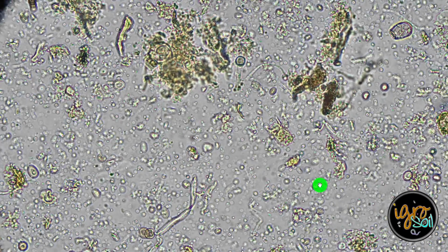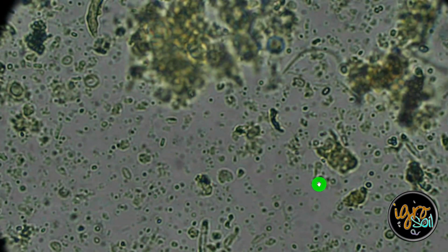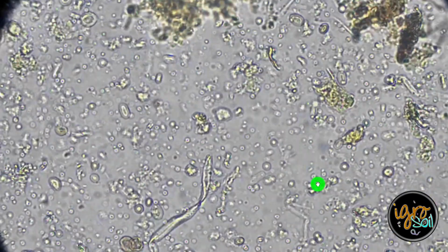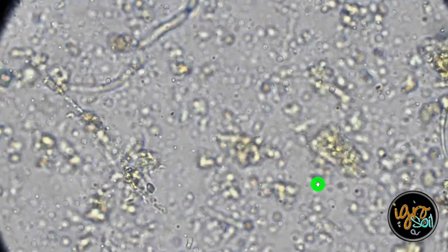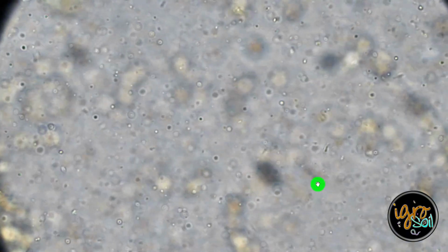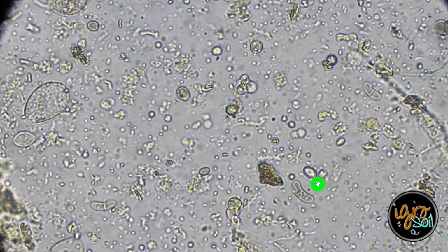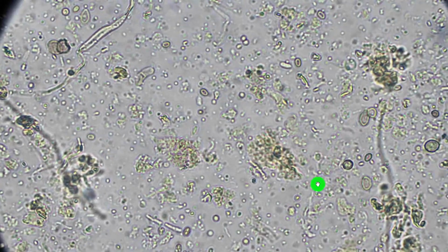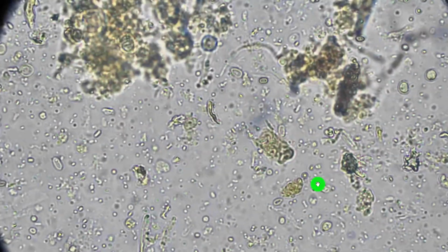Anyway. I'm at 400 magnification. I'm going to go to 600 real quick. Let's find out what's... This whole system is moving. Oh, whatever it is back there. That's a little spirela there. That's there because there was probably too much moisture, but that's only one. So spirelas usually, from what I understand, I haven't done all the research on them. They're pathogens. They're actually pathogens to us and our bodies. But you'll find that in any compost that's been sitting, that's been waterlogged for too long.